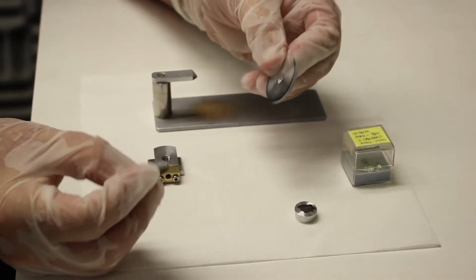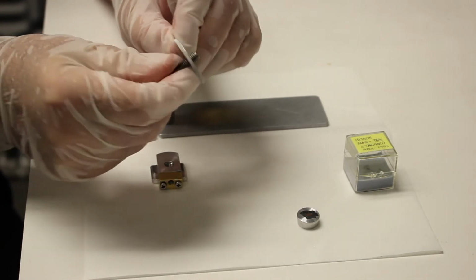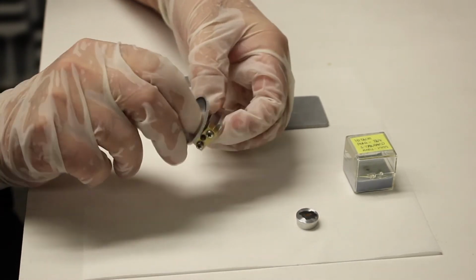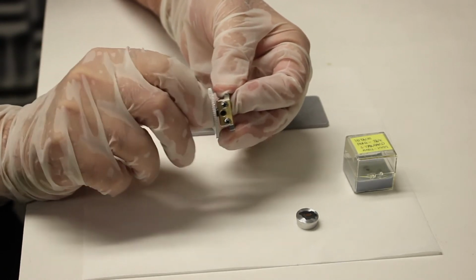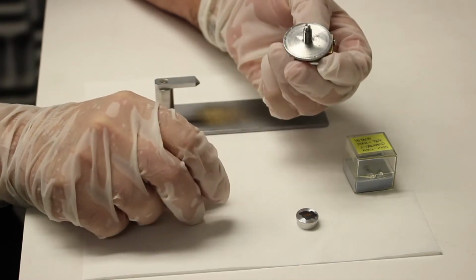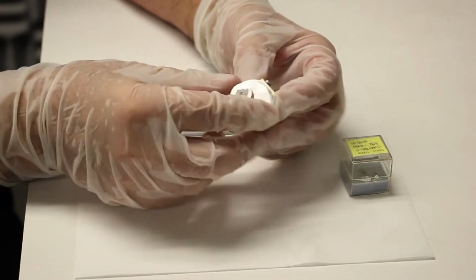So take the threaded post and feed it up through the washer. Then take the dovetail assembly, ensuring that the dovetail is on the bottom. And then you can tighten the lock washer a little. Now we can mount the sample on the top thread. Make sure it's on tight.